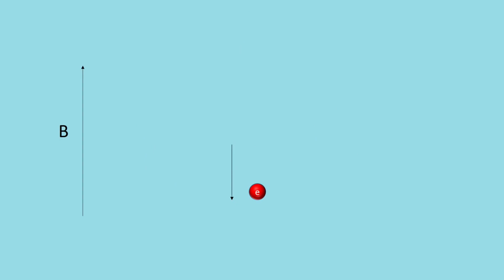Chemical shift is defined by nuclear shielding. Chemical shift is a function of the nucleus and its environment. It is measured relative to a reference compound.